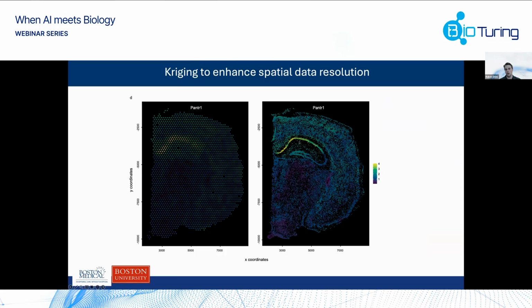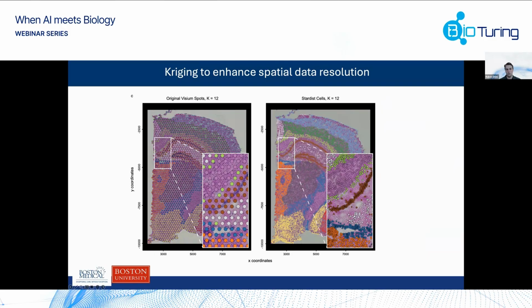So these are your nuclei, and it's obviously not 100% correct because it's an approximation, but this is the number of the genes that are expressed in these nuclei. So now you can do that for all genes, and you can do the same analysis. Again, all in Giotto Suite, you can do both analyses side by side. And you go from something that looks like this to something that looks like this, where we have identified the nuclei, which you see here in blue, and we have identified the most likely genes that are expressed in these nuclei, and you can cluster them again.